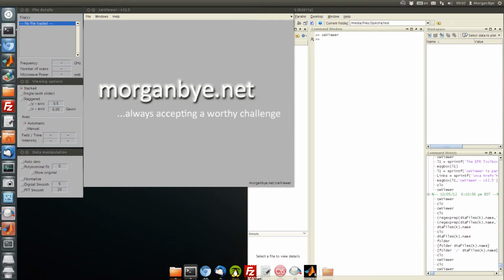Hello, I'm Morgan By, and in this video I'd like to take just a few minutes to show you around the latest addition to the EPR toolbox, cwViewer.